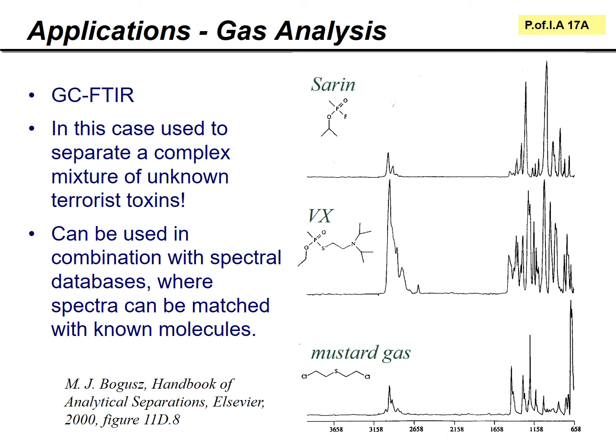Well, here is a selection of substances which I truly hope none of you ever encounter. Three particularly nasty gases here, but there are some evil-minded, malicious types who use these, and that means that there are some wonderful forensic scientists who have to be involved in identifying these gases. GC-FTIR is quite useful for this because, being gases, they can be isolated with GC and readily identified using infrared.